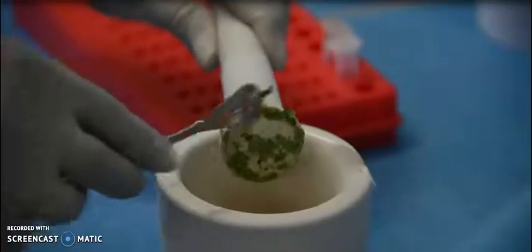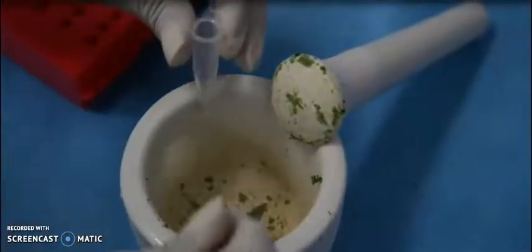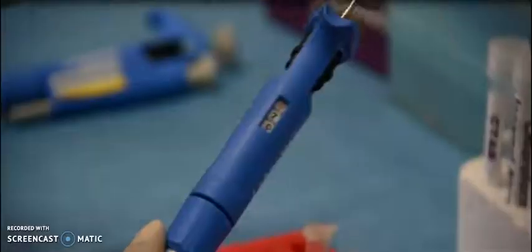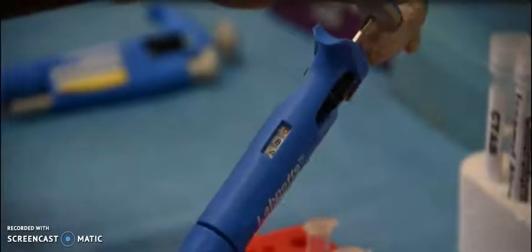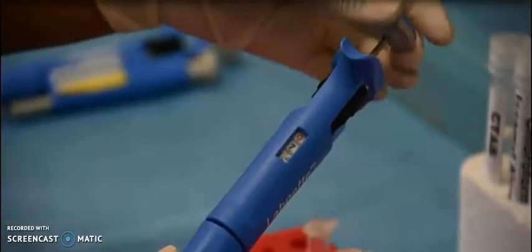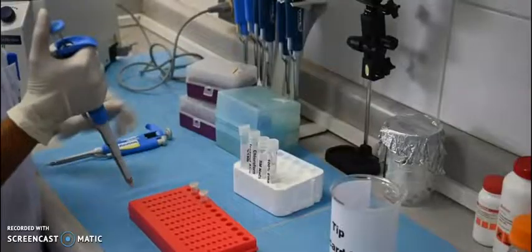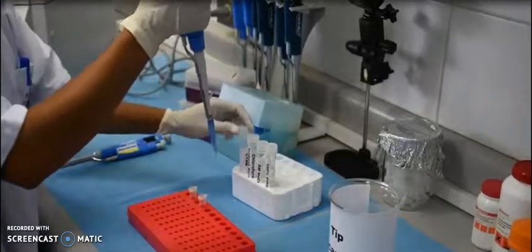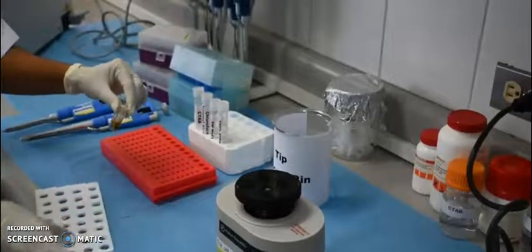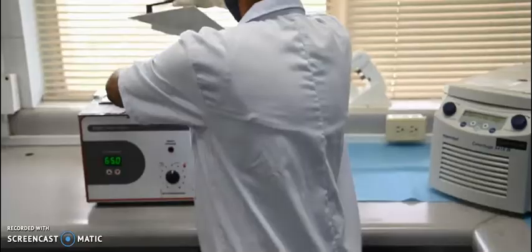After collection of plant samples, I have to measure 200 mg and grind it with liquid nitrogen. Then transfer all the ground plant sample into an Eppendorf tube and add 700 microliters of CTAB lysis buffer. Vortex the mixture, then incubate at 65 degrees Celsius for 20 minutes in a water bath.